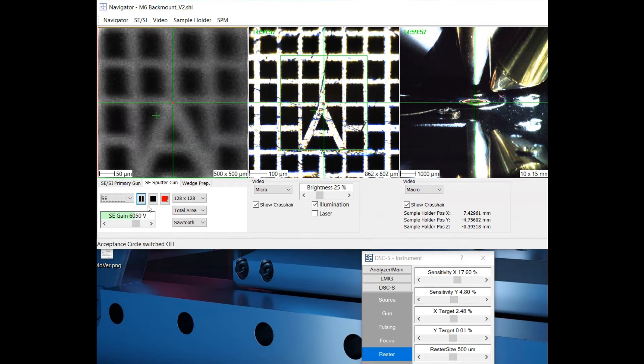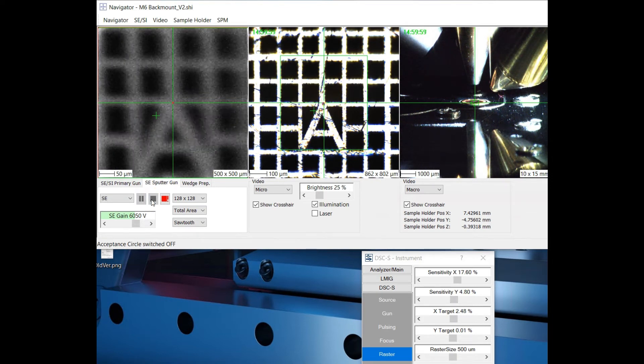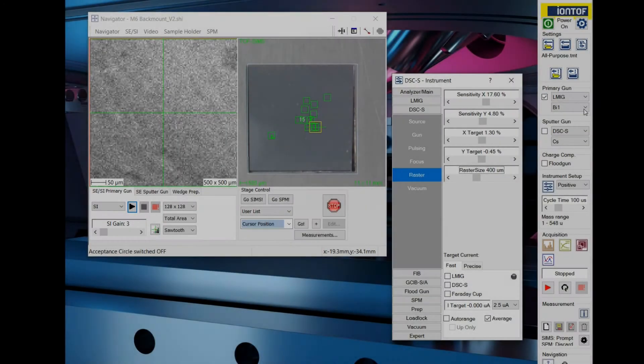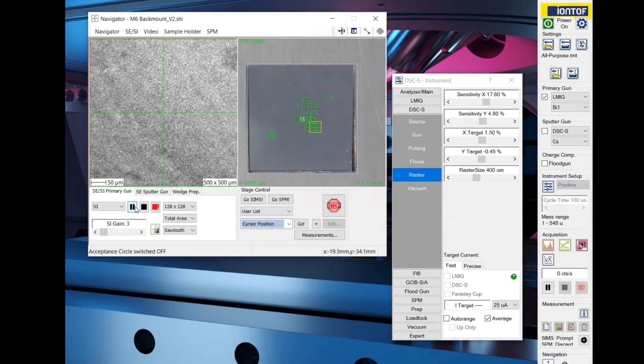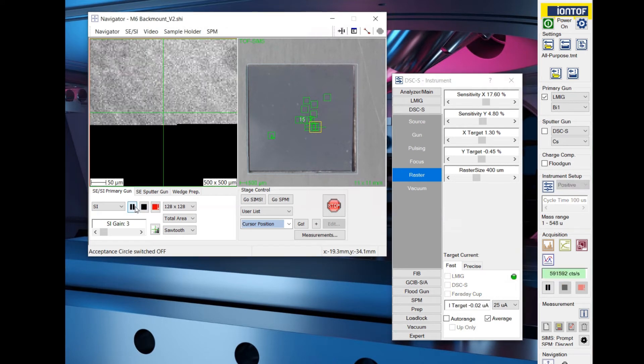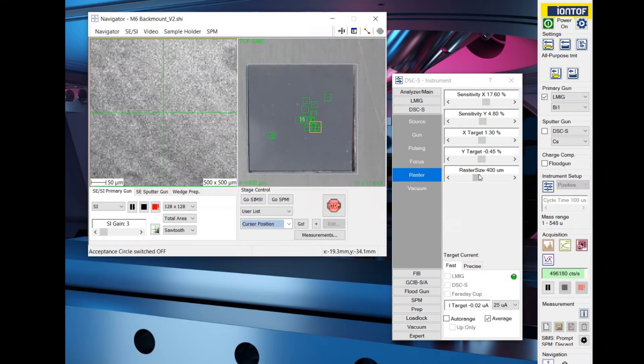The software has now calculated the correct values for XY target deflection. If you are on a sample, start an SI acquisition and make sure the height is correct.